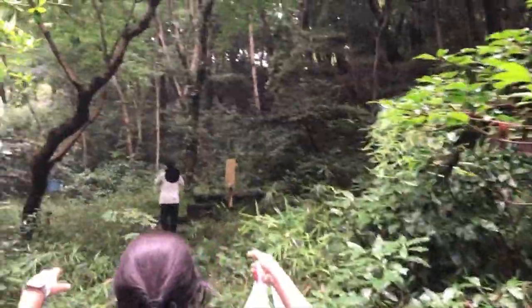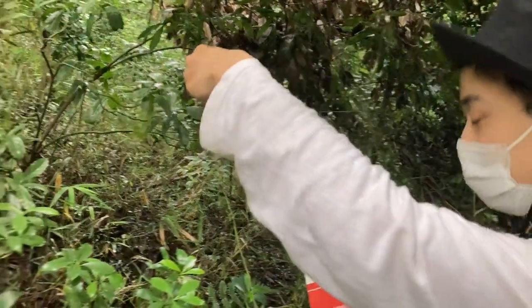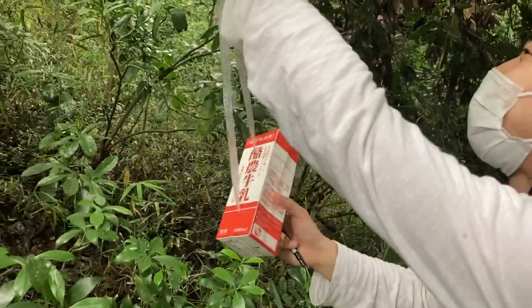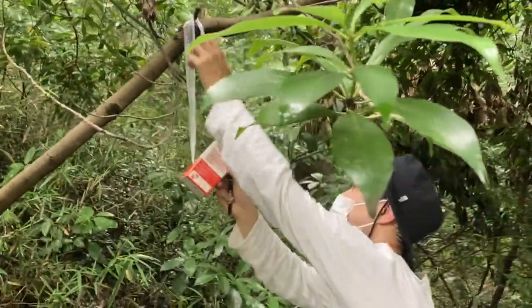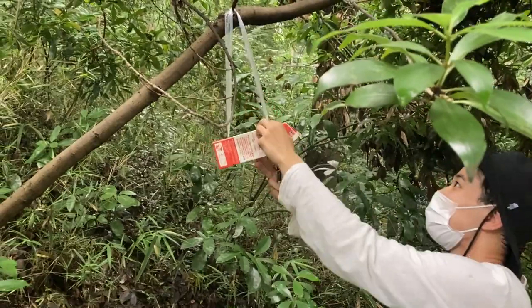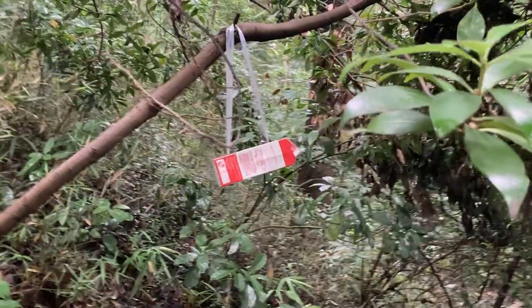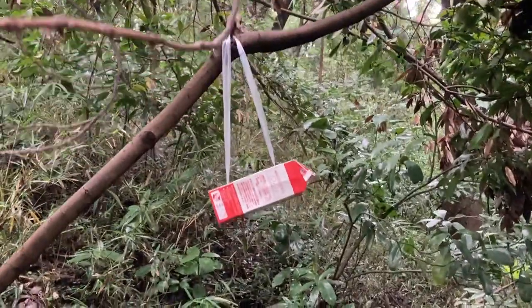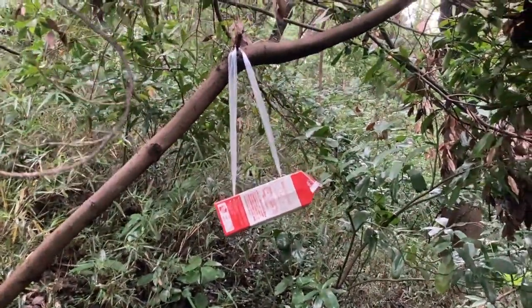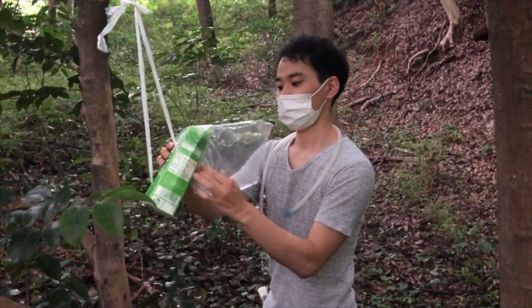Now, let's go set the trap. Set it up in a place where Drosophila is likely to live. Be careful not to let rain get inside the trap, and also be careful not to get branches or leaves inside, to prevent other insects such as ants from entering. After a few days, go to the traps and catch the Drosophila with a bag.